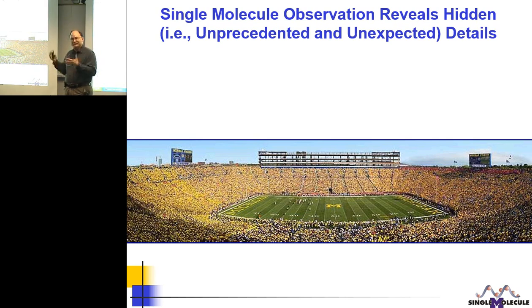So there are some techniques that are used, for example, there's a microscopy called STED. For those of you who have seen Eric Betzig talk, he mentioned perhaps briefly that he shared the Nobel Prize with Stefan Hell, and they developed a technique that uses a very high laser intensity. And then you have to really worry about this. For us, the cells typically survive a relatively long time, much longer than the single fluorophores do. So for us, typically, an experiment would look like such that we illuminate a cell with that laser only for half a minute or so, at which point all the fluorophores will probably have bleached, will have gone away. And I'll show you some data for this.